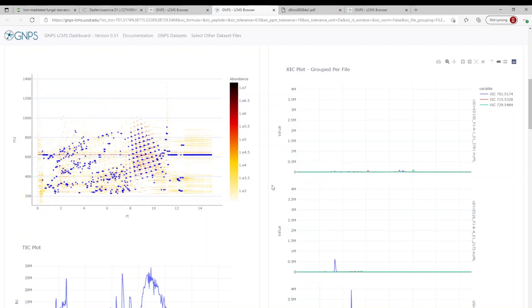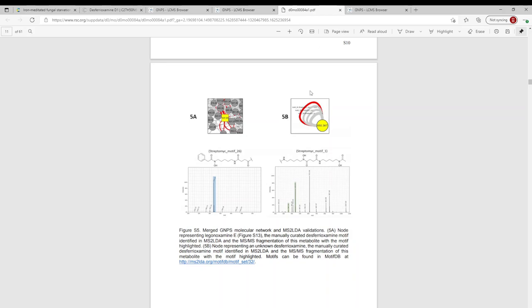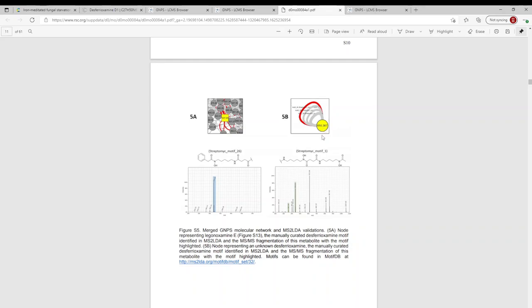And so during the study, we detected the presence of a previously undiscovered desferoxamine analog. So it's this node here, and it was identified using MS2LDA. And this actually is a M plus 2H double charged metabolite. And no metabolite this large has ever been shown to be a potential desferoxamine analog. So of course, this is very interesting to us.